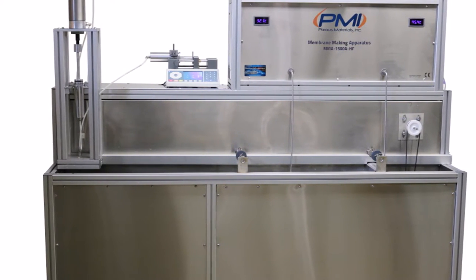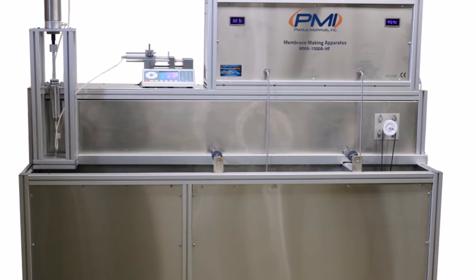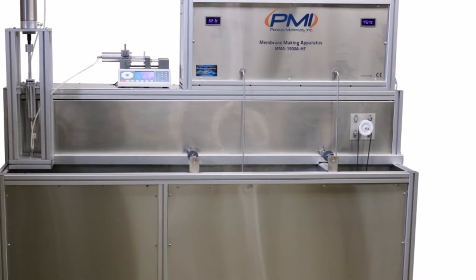The hollow fiber membrane making apparatus is provided with advanced custom-made software that is simple to use while allowing for advanced precision and repeatability.